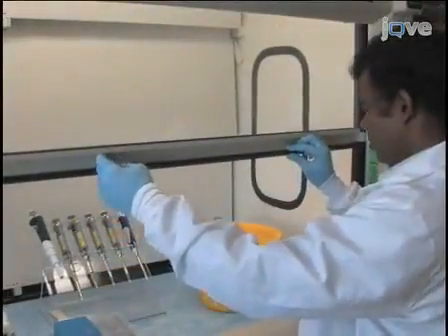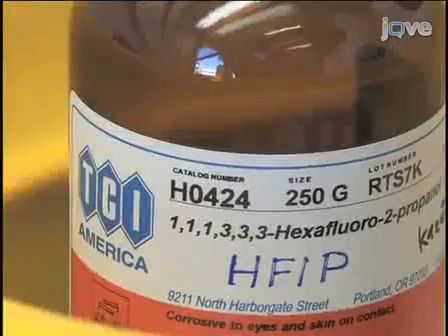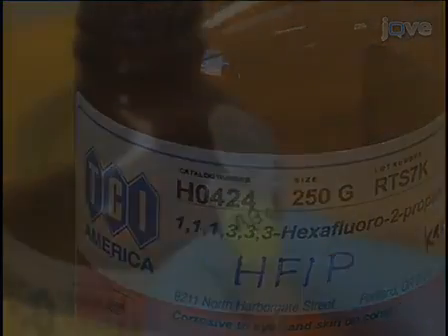To begin the protocol, hexafluoroisopropanol, or HFIP, which has been pre-chilled on ice, is added.